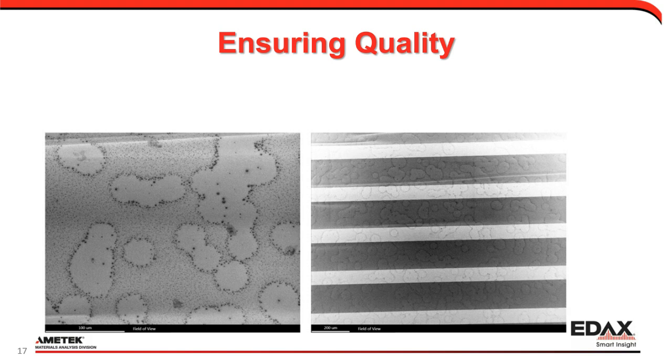But with the latest silicon nitride windows, you can safely plasma clean your detectors, and so something like this would be avoided. You'd prevent an EDAX repair altogether. But here at EDAX, we do now strive to ensure the quality of all detector units that are out there, and using our own microscopy and microanalysis equipment to ensure that quality.